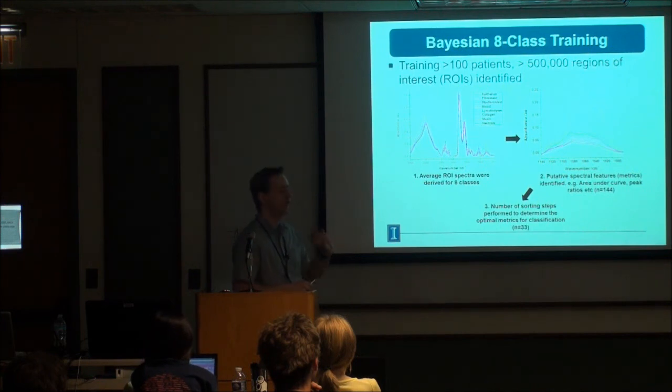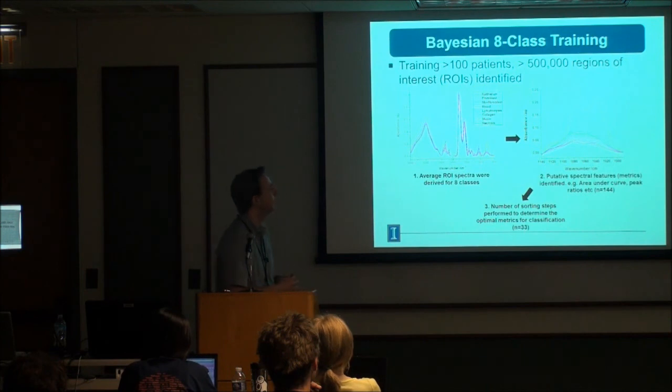When you have something like this, because it's true biological peaks, typically when you try on different systems, or if something's gone wrong with your sample, someone sneezed on your sample or something, it tends to hold up very well. PCA tends to fail on these type of things. So yeah.